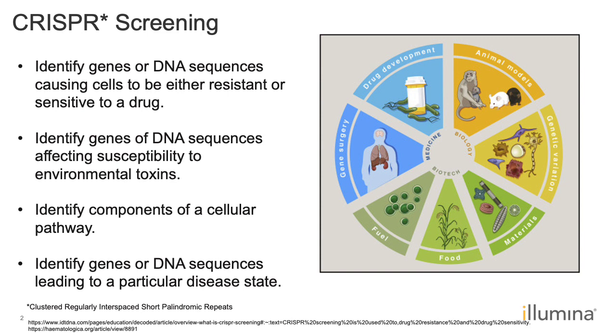Now, CRISPR screens allow you to discover key genes that elicit a specific function or phenotype under investigation for a given cell type, while starting with a very broad hypothesis, or in some cases, almost all of the genes in the genome. And so these CRISPR screens then enable you to generate a new narrow hypothesis, as what you're able to get from a genome-wide CRISPR screen is a short list of candidate genes or sequences that produce that physiological response under investigation that can then be investigated further.